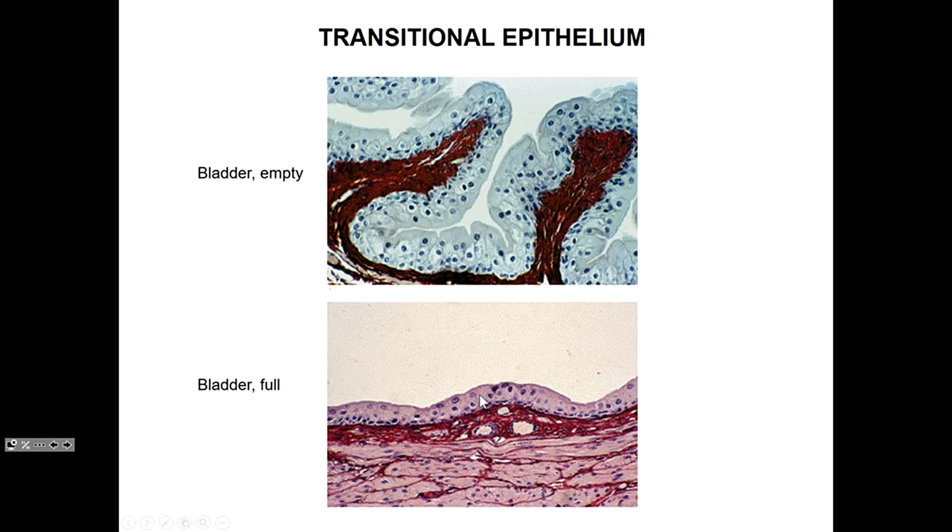There was another question there first. So again, the top layer changes in shape. Well, actually all the cells, but it's usually the top layer of cells that we're looking at to see whether they've changed shape or not, right? Pardon? Sometimes there is a binucleated cell not shown here, but I do believe I have examples of binucleated cells of the bladder in my lectures, and we will see them at some point, okay?